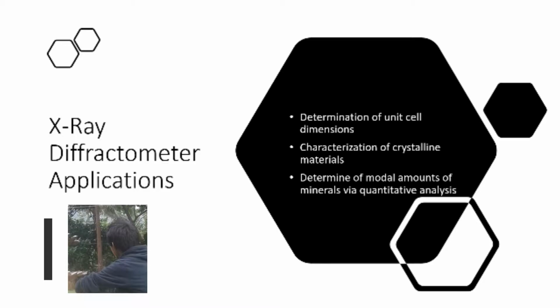So, for example, kay unknown material na solid, basta solid siya, you have to ground it first para makita siya, because we are scanning a molecular level ng item. So that's why it has to be extremely minute. I will show a video sa iyahang methods sa pag set up sa machine.